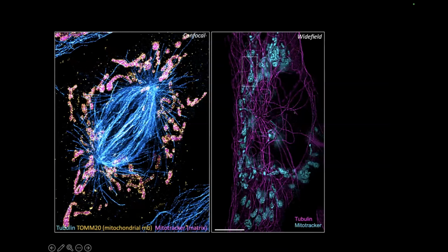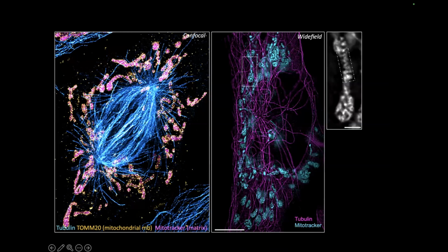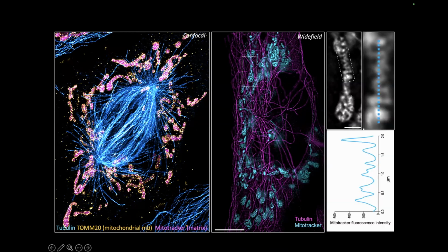And then just to show you a little more example of the mitochondria staining, we're also quite happy that we could see the cristae of the mitochondria. Here again, using MitoTracker, localizing inside the matrix. And just to give you a little bit of the resolution we can reach, we can really decipher between the different cristae. So this could also be achieved with chemical fixation, but we also had to show that, yes, it was better in some ways and in other ways, at least equal.